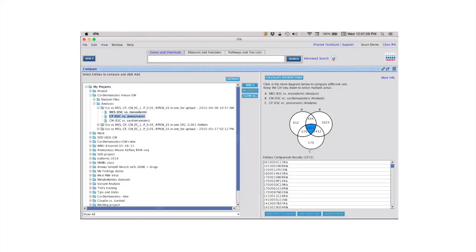It's sometimes hard. Okay. Can you talk a little bit about what type of input data we should provide to get a differential expression analysis down to the isoform level? Should we input the read report for each condition and do a comparison analysis, or provide the list with FC and p-val already? If the second option is the favorite, then what is your favorite RNA Seq analysis algorithm? Cufflinks, CuffDiff, or DESeq, for instance?